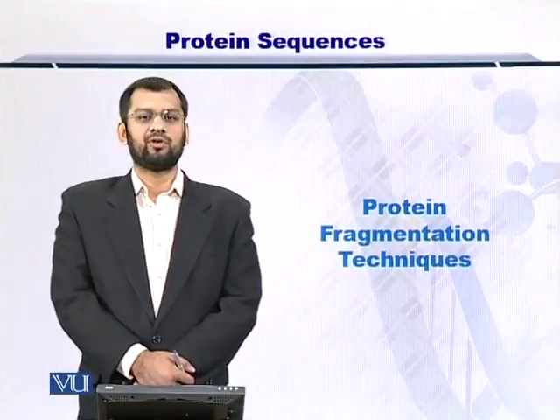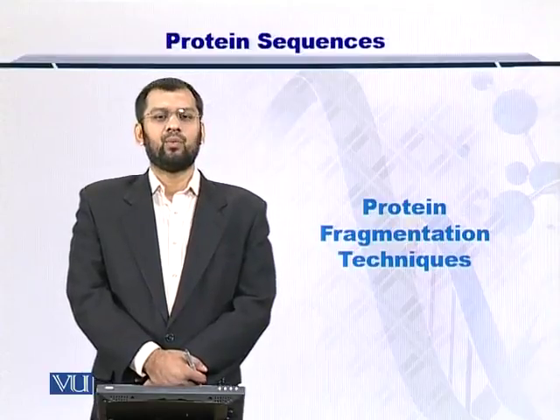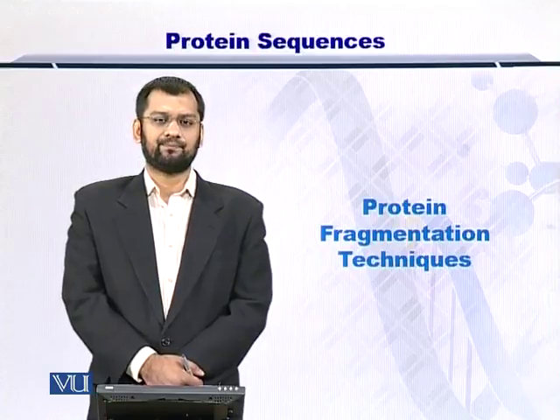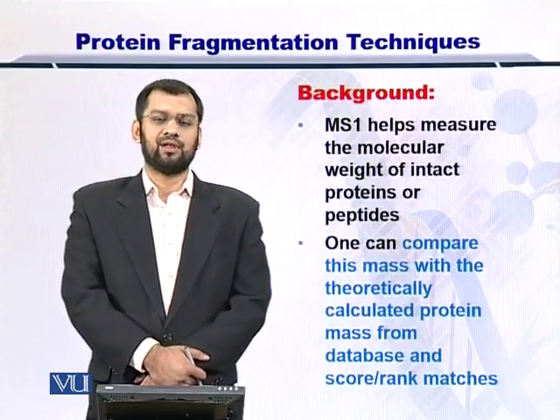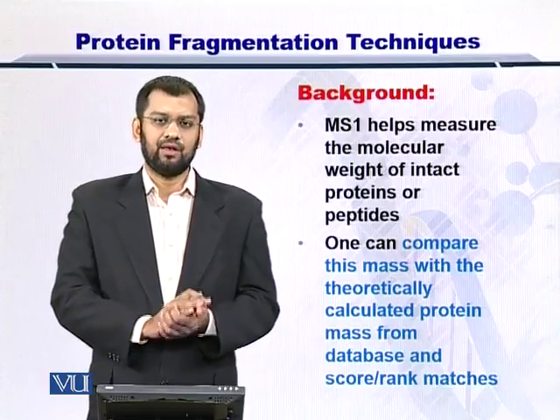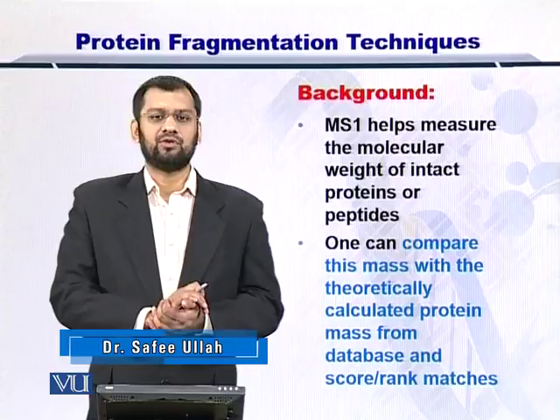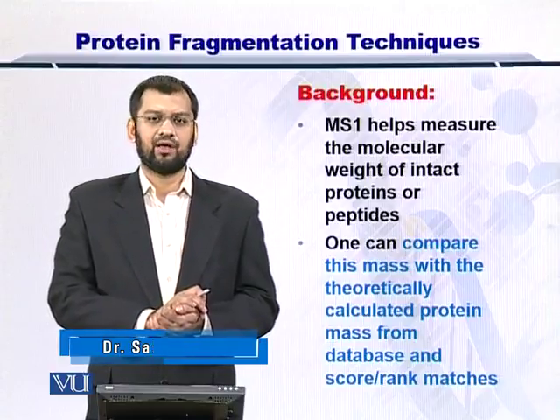Dear students, in this module we're going to look at the protein fragmentation techniques. Why would one want to fragment the proteins in the first place, or the peptides that are there in the sample? As you know, MS1 helps you to measure the molecular weight of the intact peptide or the intact protein. So once you have measured the intact mass of the sample protein or peptide, then you can compare it with the theoretical mass of the protein or peptide in the database.